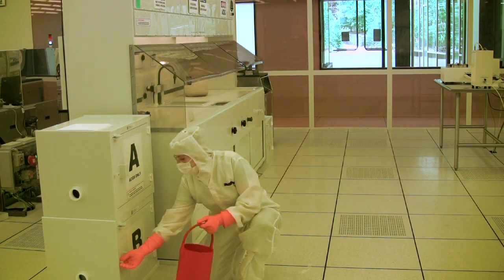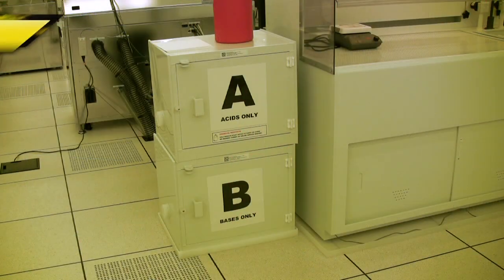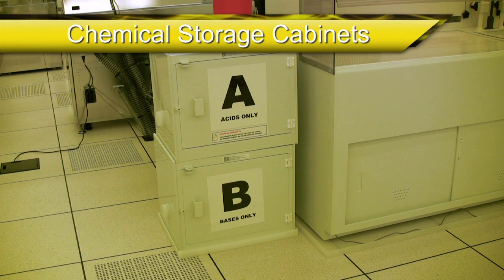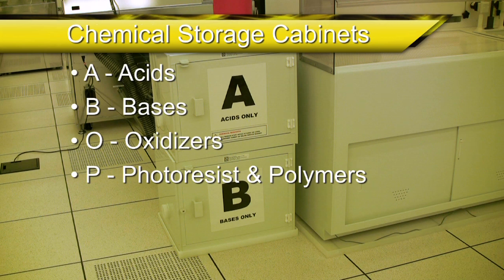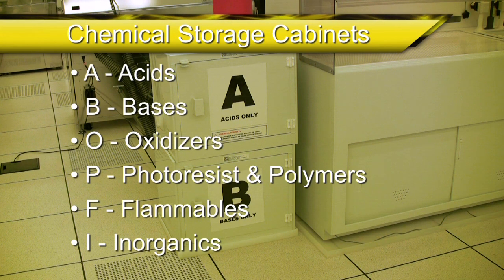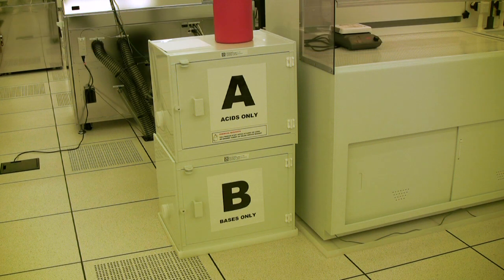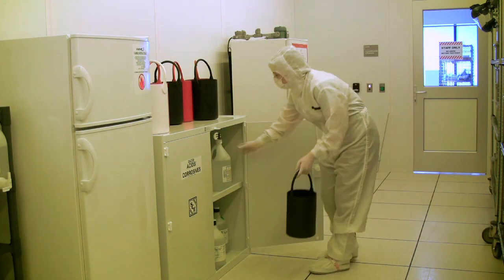Let's now discuss where specific types of chemicals are stored and the proper method for transporting chemicals from one location to another. There are chemical storage cabinets found next to each fume hood within the cleanroom, and each cabinet is designated for a specific type of chemical. Acids are stored in cabinets marked with an A, bases in cabinets marked with a B, oxidizers with an O, photoresist and polymers with a P, flammables with an F, and inorganics with an I. If a particular chemical cannot be found at the fume hood, there are additional chemical storage cabinets located in the cleanroom supply storage area.